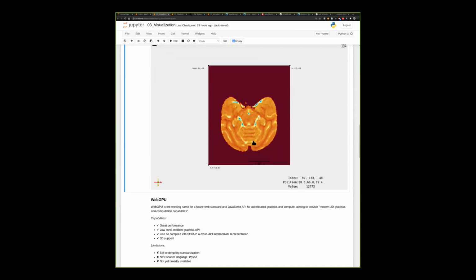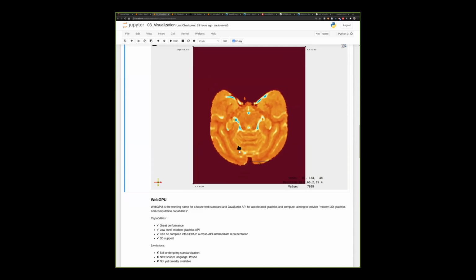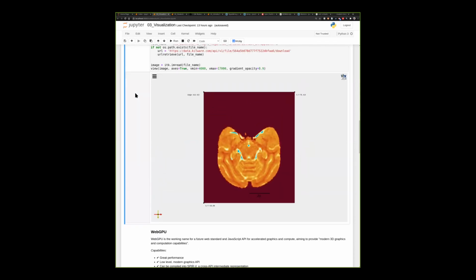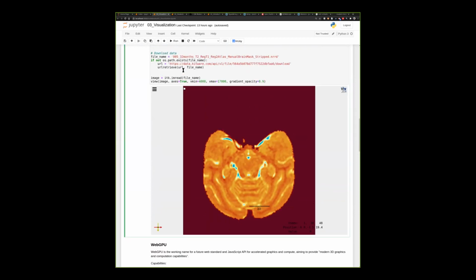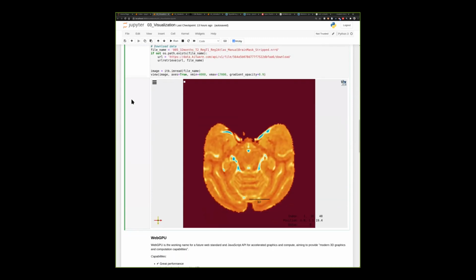I'm not too familiar with Vizarr. It's relatively new. This is a little older. We're working to also add support for Zarr and these multi-scale data sets. There's work in progress to make that happen for this rendering tool. ITK widgets is the Jupyter widget interface, but there's also a standalone JavaScript library that this is based on called ITK VTK Viewer.